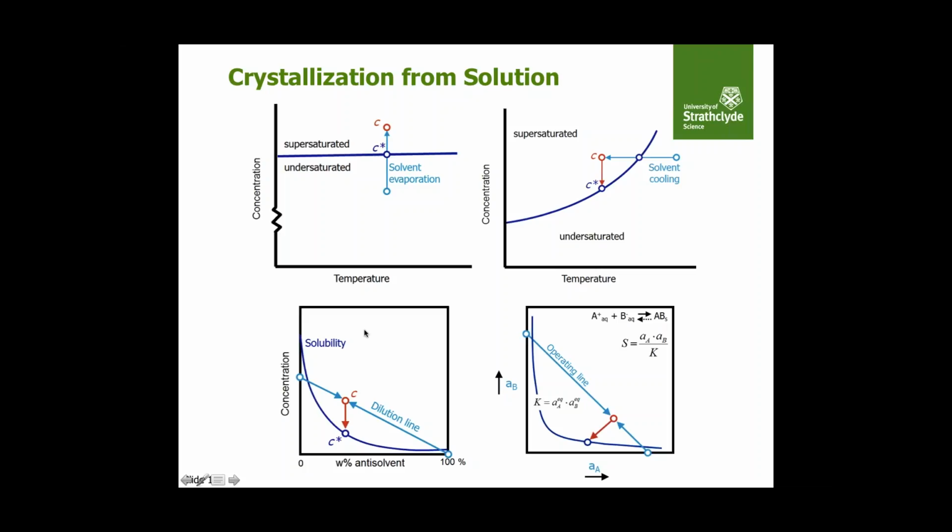So all these crystallization processes are actually determined by the solubility line. So it is very important to know how the solubility behaves as a function of temperature, or as a function of anti-solvent fraction, or as a function of the composition in a multi-component system.